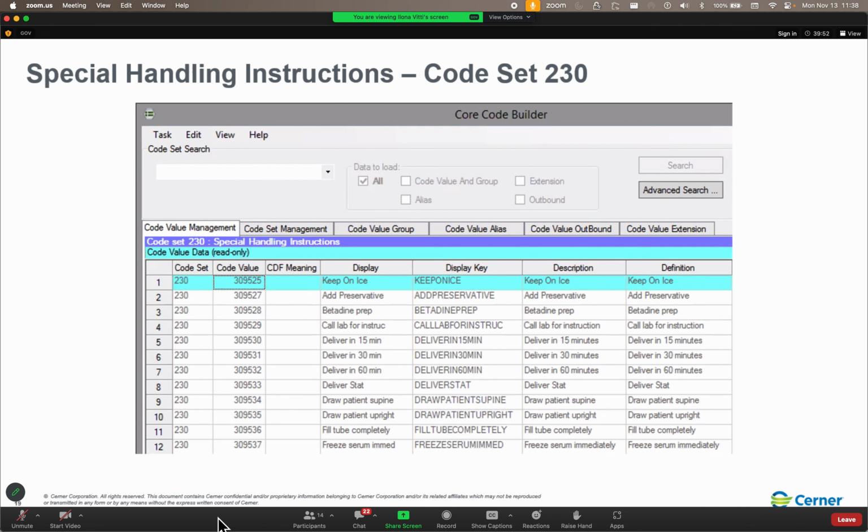And my theory is that because Cerner started out as a laboratory information system company, and then the very first solution that was added was radiology, radiology actually borrowed a lot of our code. And in this case, a radiology order has to have a specimen type in order to make it through the rad share portion of the order server.